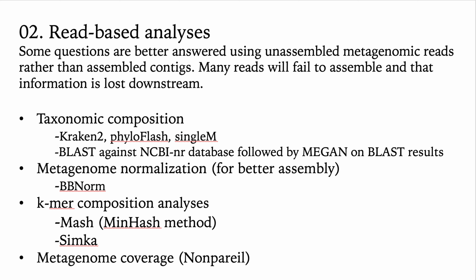And so some analyses that rely on using just short reads include some taxonomic composition analyses. You can use programs like Kraken2, PhyloFlash, SingleM. You can also just BLAST your reads against any database. The NCBI nr database will be the most comprehensive. And then you can run something called MEGAN on your BLAST results, and that will give you an overview of taxonomy just based on your BLAST annotation to NCBI.